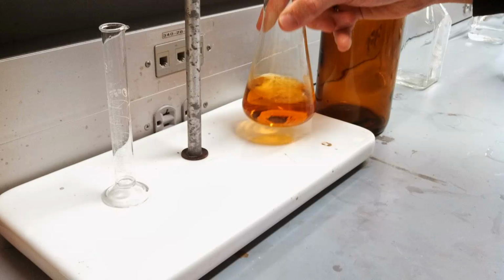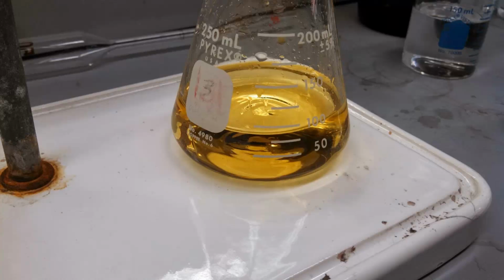As you titrate with the sodium thiosulfate solution, the solution will pass through this amber color, eventually turning into yellow and then pale yellow. At the endpoint, the disappearance of the pale yellow indicates that there's no more I3-, but that's hard to see. So at a certain point you're going to stop before the endpoint and add a solution of 1% starch suspended in water. The starch complexes to the triiodide and forms a blue complex, and the disappearance of the blue is easier to see than the disappearance of the yellow.